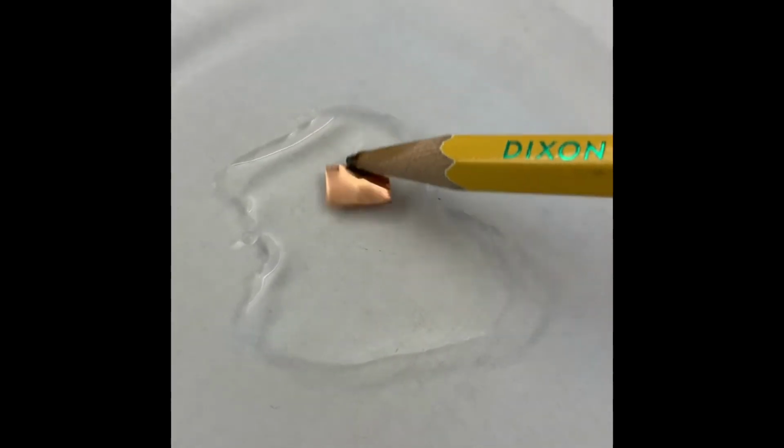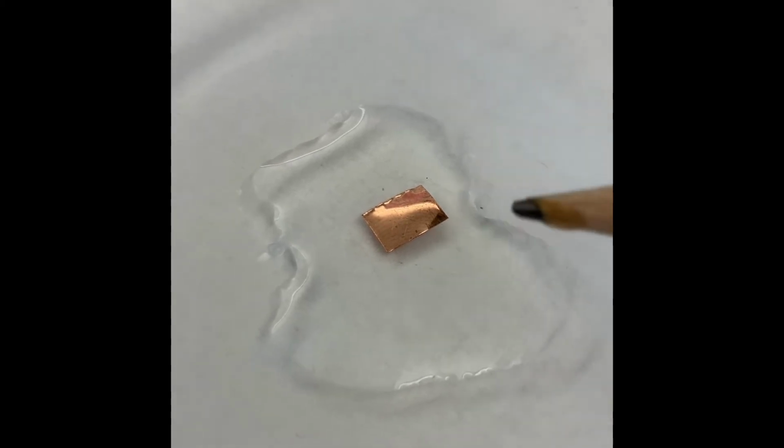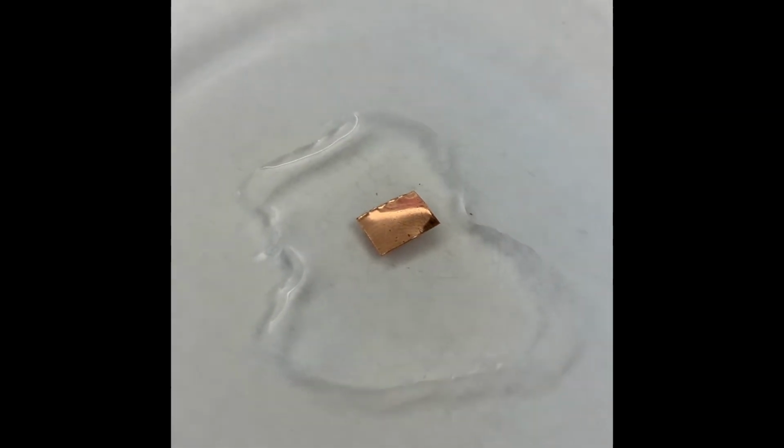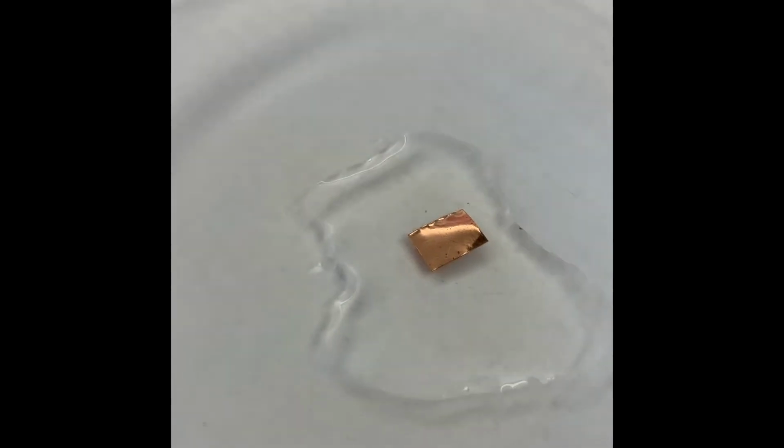There we go, flip it over. Not too much happening here either. It looks like a little discoloration on the side, that's just a shadow.